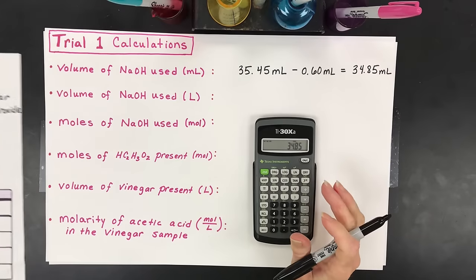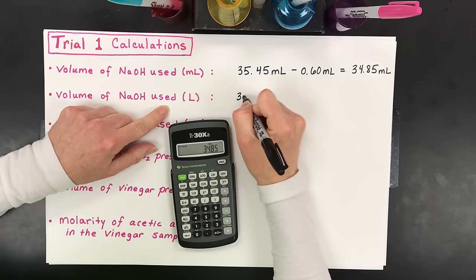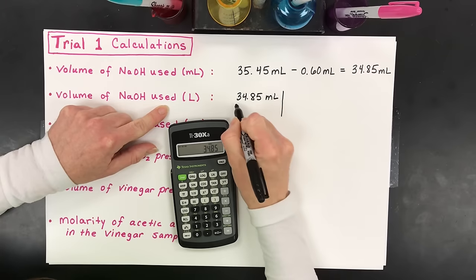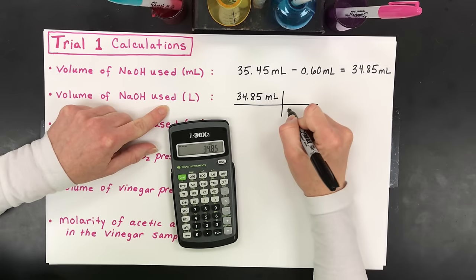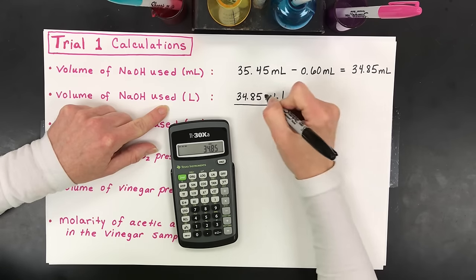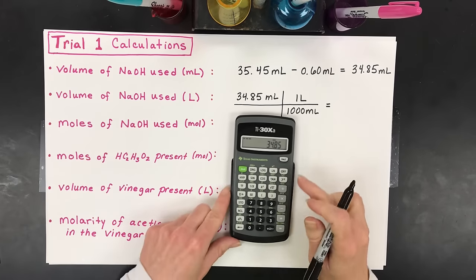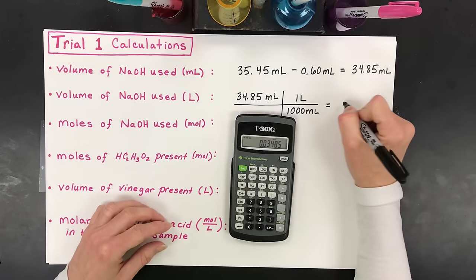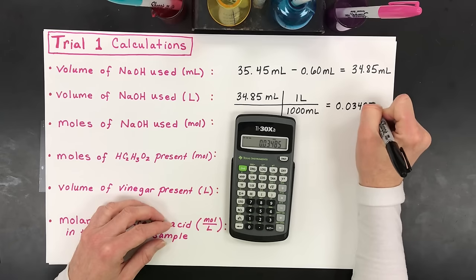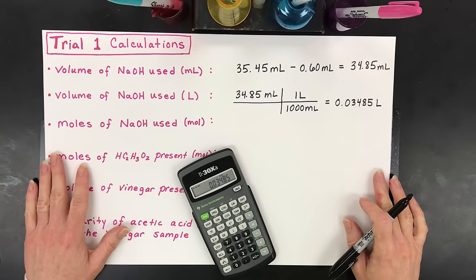Next step is to calculate the volume, but in liters. So 34.85 is in milliliters, and I'll tell you why we need it in liters in just a second. There's 1,000 milliliters in 1 liter, so put 1,000 in the denominator, so these cancel, and then you'll get, if you need to, you can divide it by 1,000, or move the decimal place, 0.03485, and that's liters.